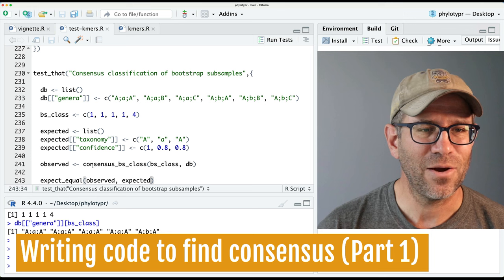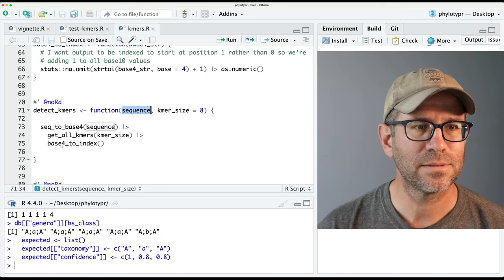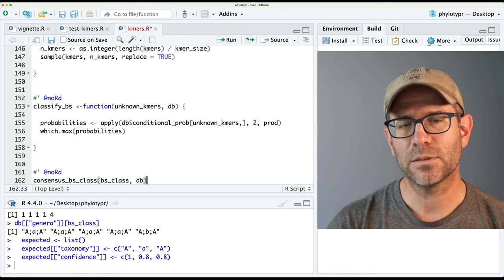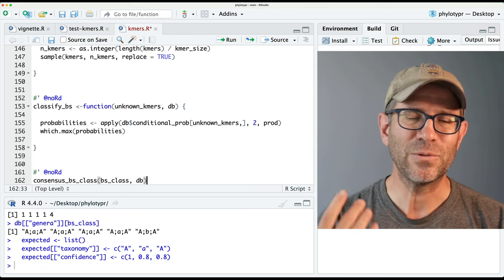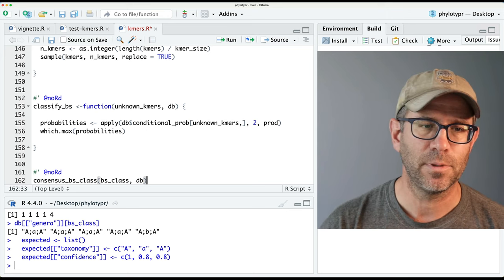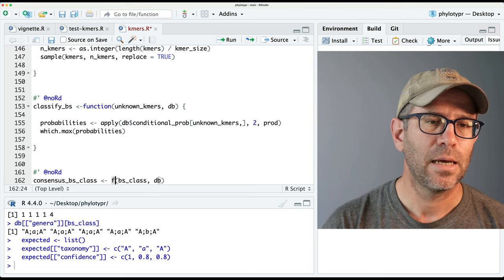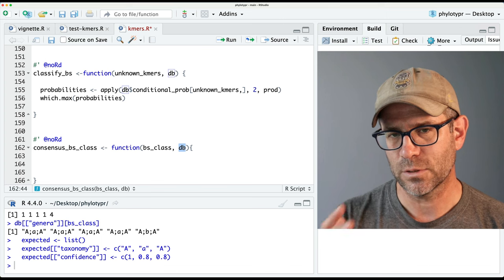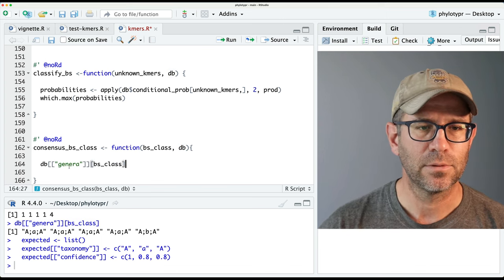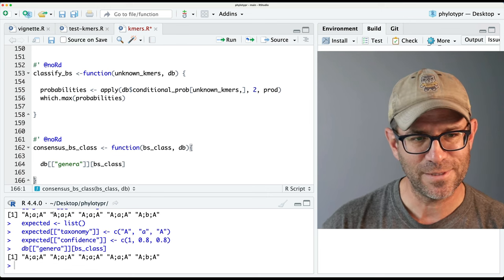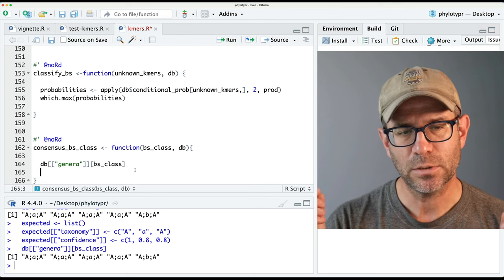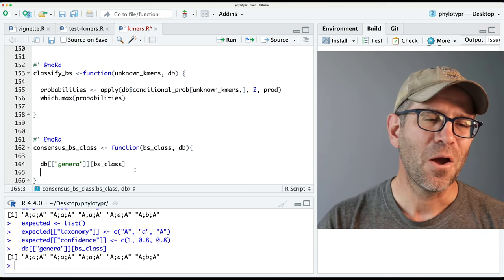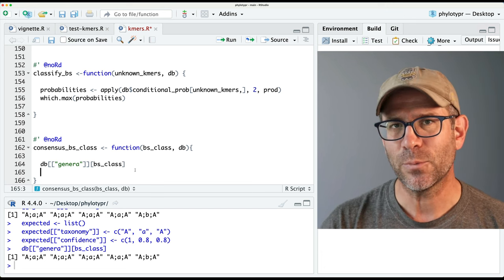So we now have our task and we can copy this description over to our kmers.r file. I'll start with no_rd, which tells the documentation function in devtools not to worry about documentation for this function because it's not going to be exported. Then we have consensus_bs_class as a function. What we're taking in is this vector of classifications and also the database. I'm thinking that we're going to need to split apart these classification taxonomy values by that semicolon. We've seen something like this before — we talked about stri_split, which tends to be a bit more performant.